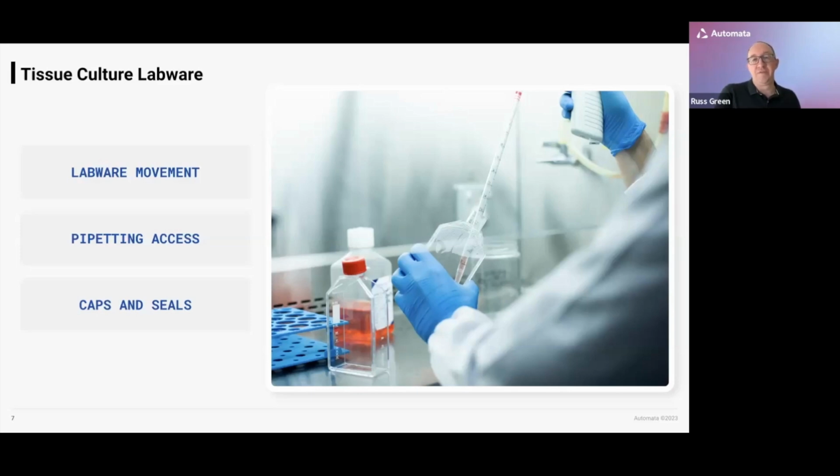Of course, these pieces of labware also utilize closures that are normally some kind of screw cap, and again, we can automate them ourselves at Automata. We built a screw decapper, but if we can avoid doing that, that takes away a process step that otherwise might not be required. Just a brief word on the pipettes here. I think finding an off-the-shelf pipetter that can handle that kind of volume or length of pipette in an automated world is again not impossible, but it is very challenging and very limiting.